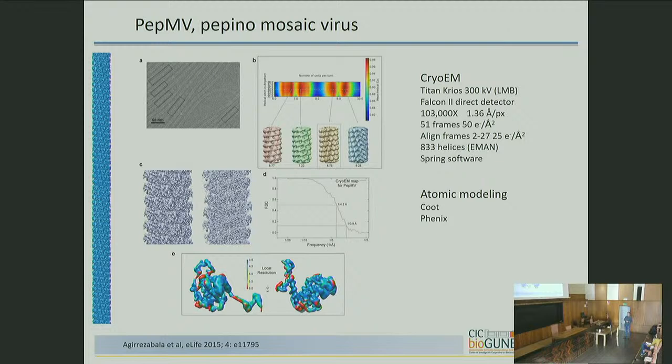As I said, using the single particle approach and taking advantage of the helical symmetry, we got a map at about 4 Angstrom resolution. The average in our case is always more or less the same. The size of the data set we can collect, and the flexibility, impose some kind of restriction in the resolution. In most of the maps we have worked with, we always get about 4 Angstrom resolution. And we can see here, for instance, the estimation of the local resolution. The red ones are the regions with poor resolution.